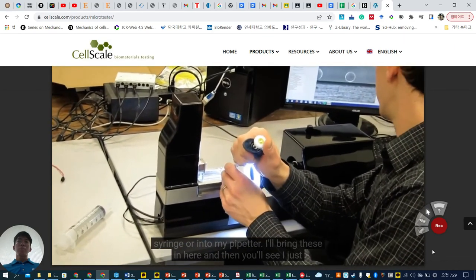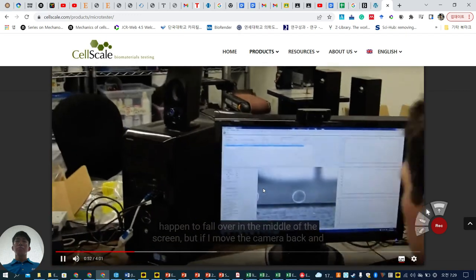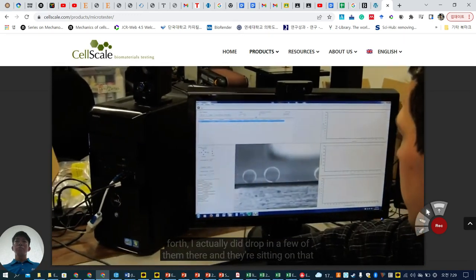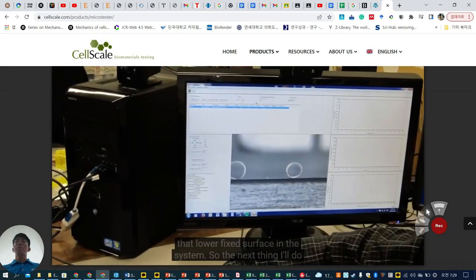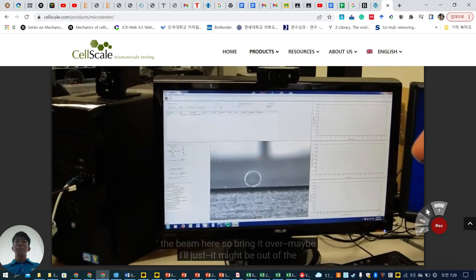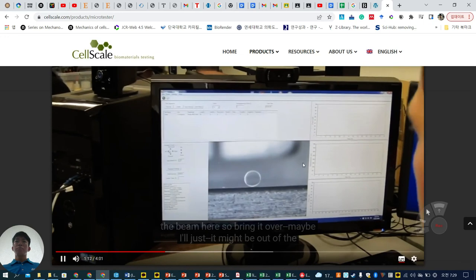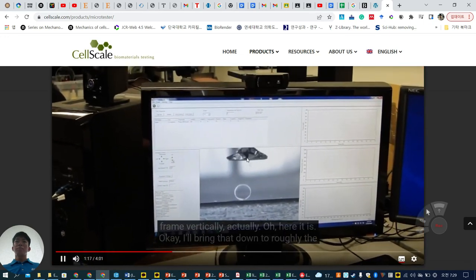And then you'll see I just dropped a couple in from the chamber. So on the screen here, there's one here. Just happened to fall right in the middle of the screen, but if I move the camera back and forth, I actually did drop in a few of them there, and they're sitting on that lower fixed surface in the system. So the next thing I'll do, while I'm still at low zoom, is I'm going to bring over the top of the beam here. So we'll bring it over. Maybe it might be out of the frame vertically. Here it is. Okay. And I'll bring that down to roughly the right position.